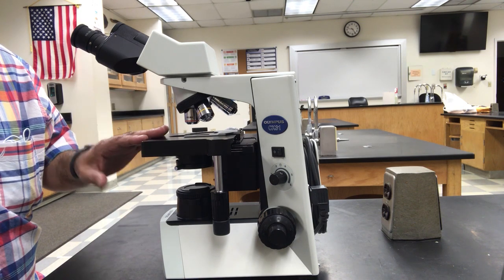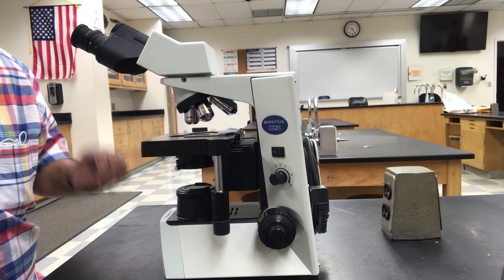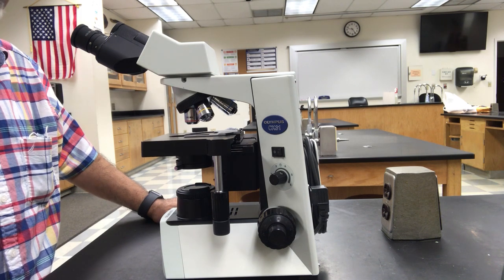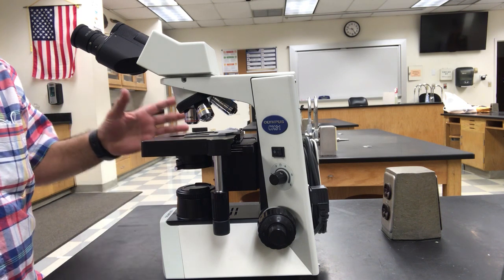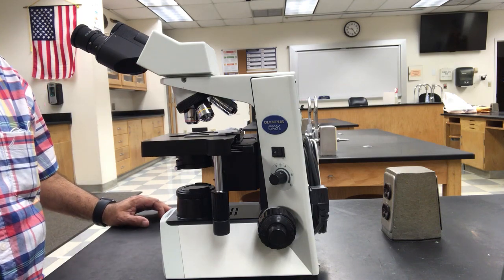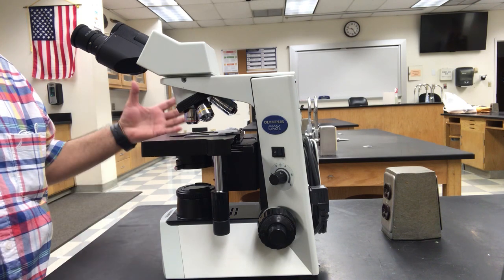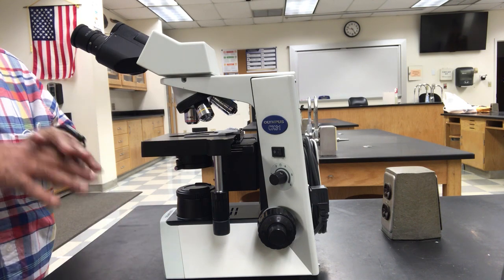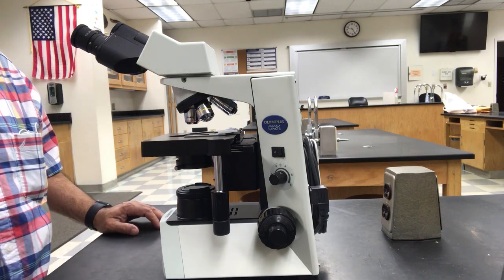It has two major functions. The two functions are magnification and resolution. You would see that in the very first page of your lab manual, the exercise 2. Magnification obviously means it would enlarge the object, and resolution means clarity. It not only would enlarge a tiny cell, but it would continue giving a clear appearance of those tiny structures.